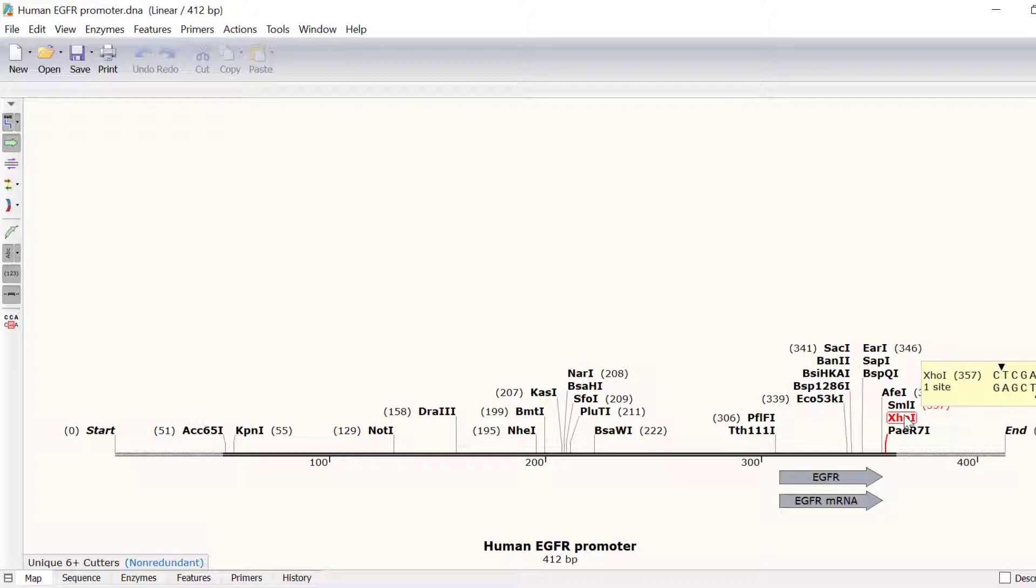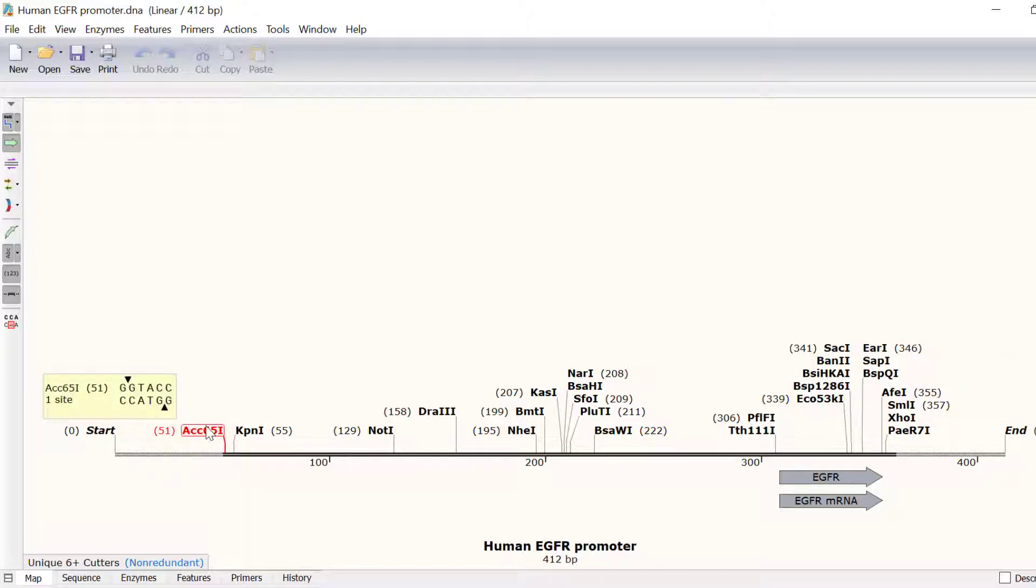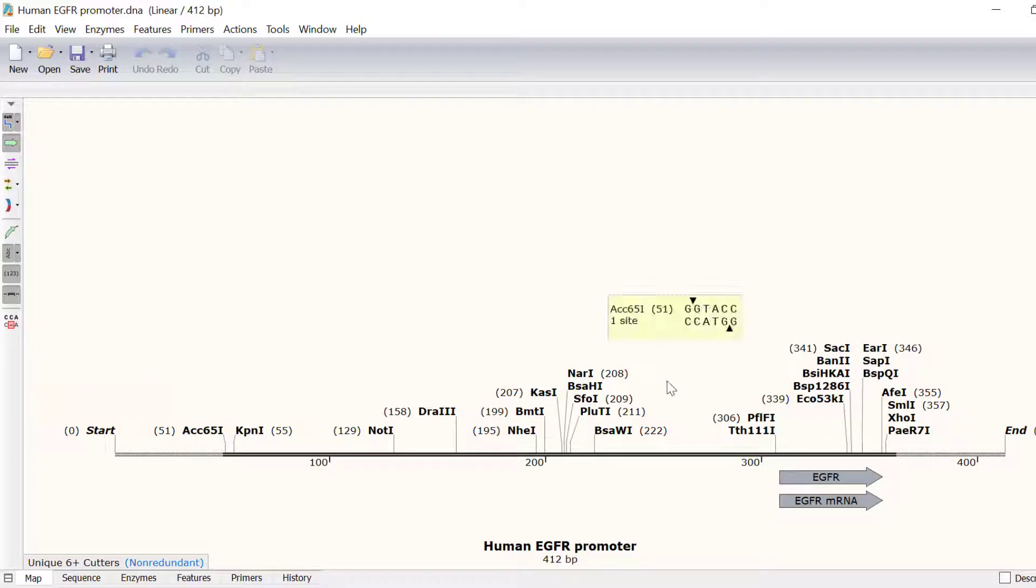So I can see that there is a single site for ACC651 and a single site for XHO1 in this sequence.